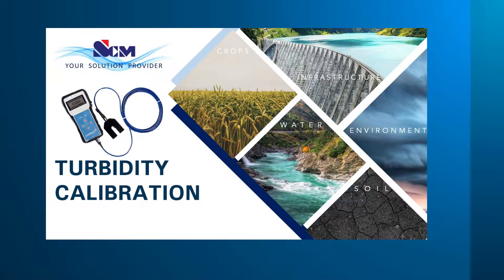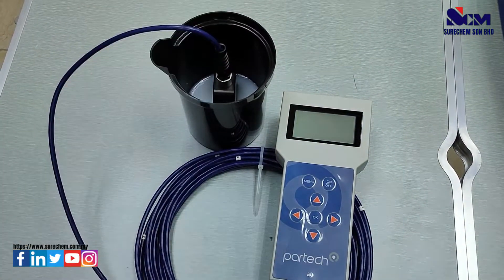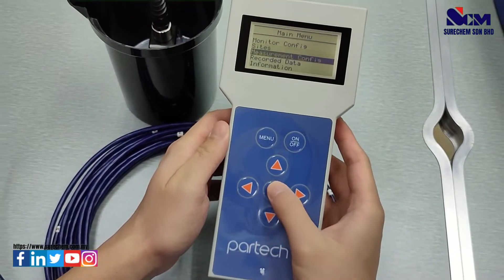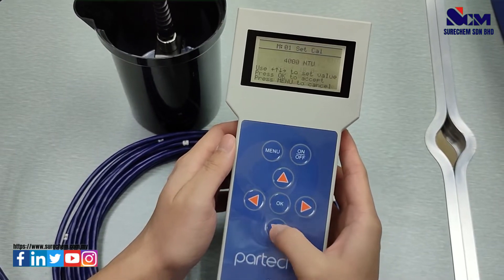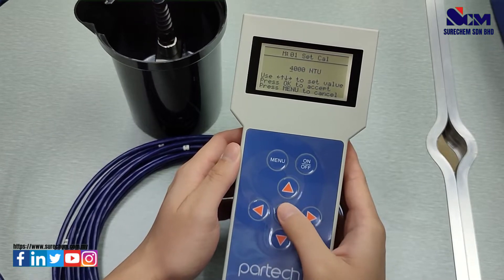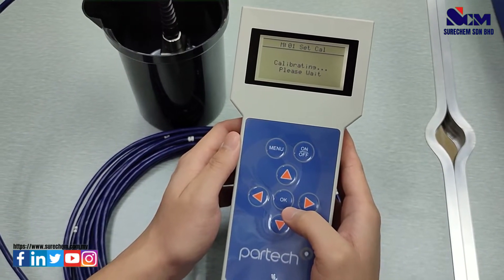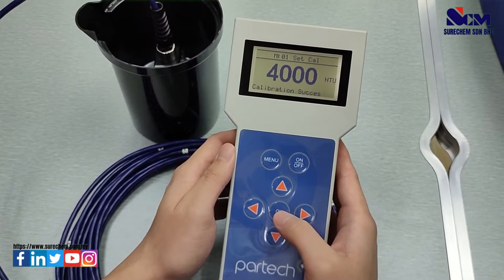For turbidity calibration we will use a 4000 NTU solution. Put the sensor into the 4000 NTU solution. Select Menu, go to Measuring Configuration, go to Set Calibration, press OK, select 4000 NTU, and press OK to calibrate. Wait for a moment and it will show calibration success.